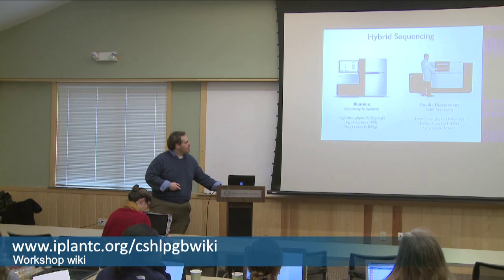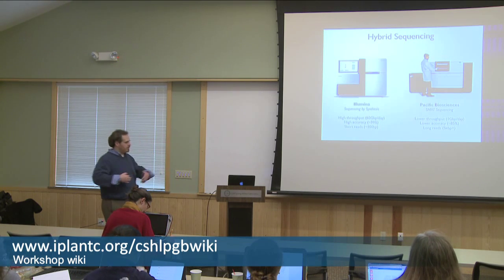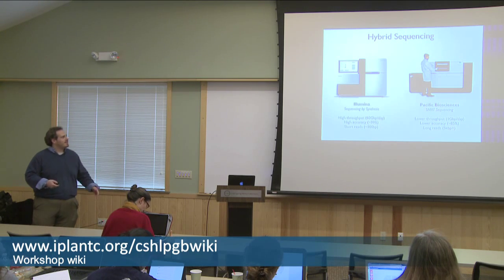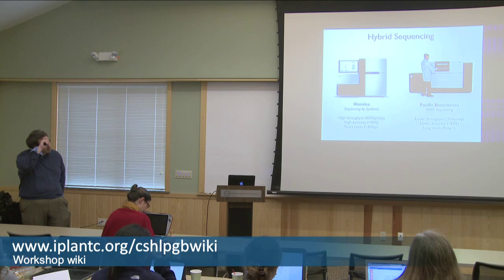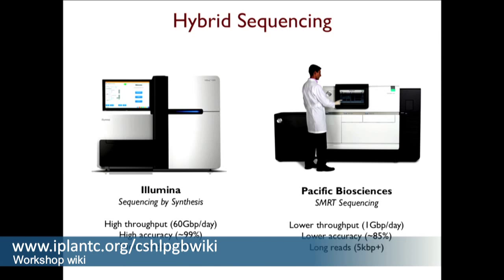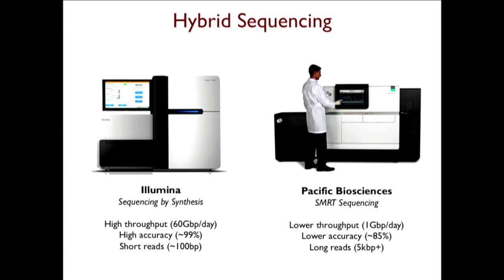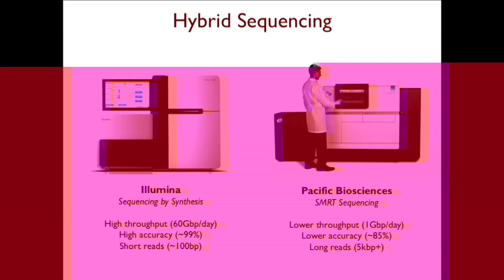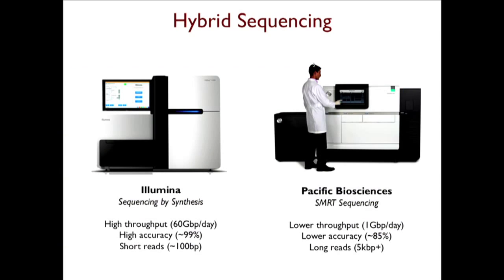So given these very long reads, we want to try to make use of them for assembly. The best data I have actually seen has come from the PacBio RS instruments. It's great in the sense that you get long reads, but by other metrics, it lags behind, say, Illumina sequencing. In terms of throughput, it's much lower. And in particular, in terms of accuracy, it's far, far behind. The raw base call accuracy is far behind the Illumina sequencing.